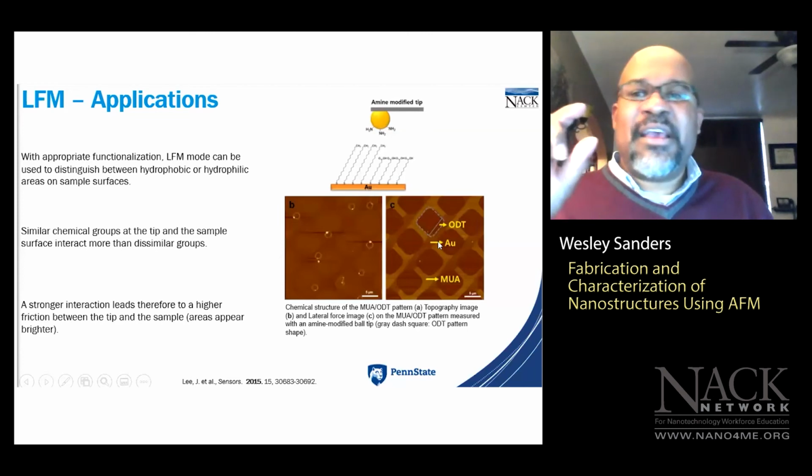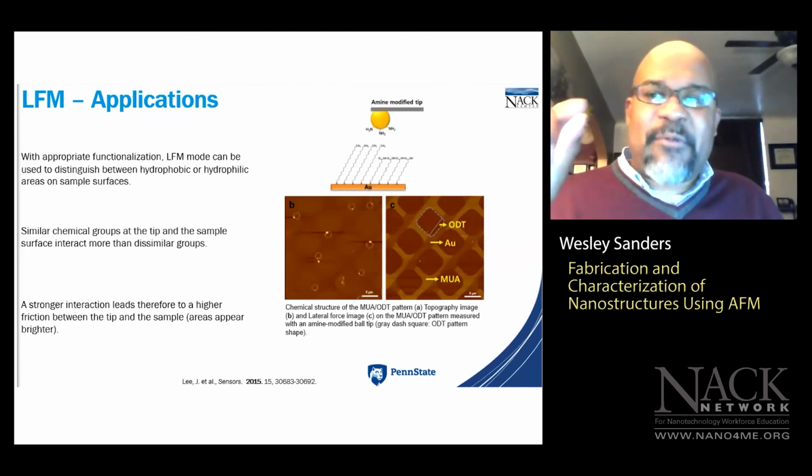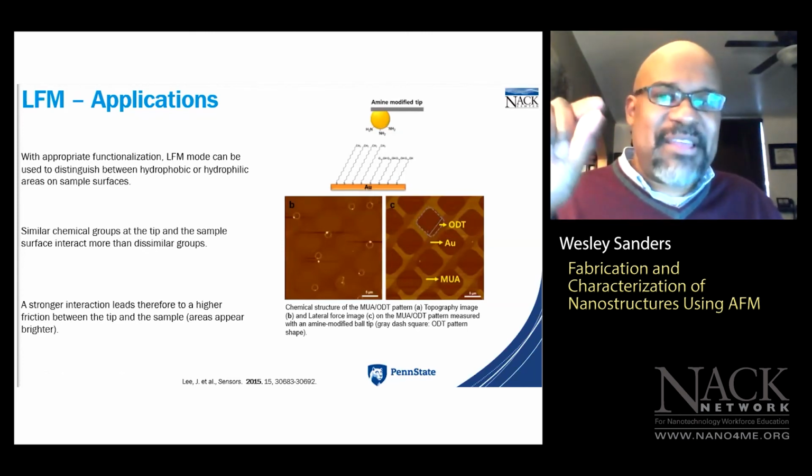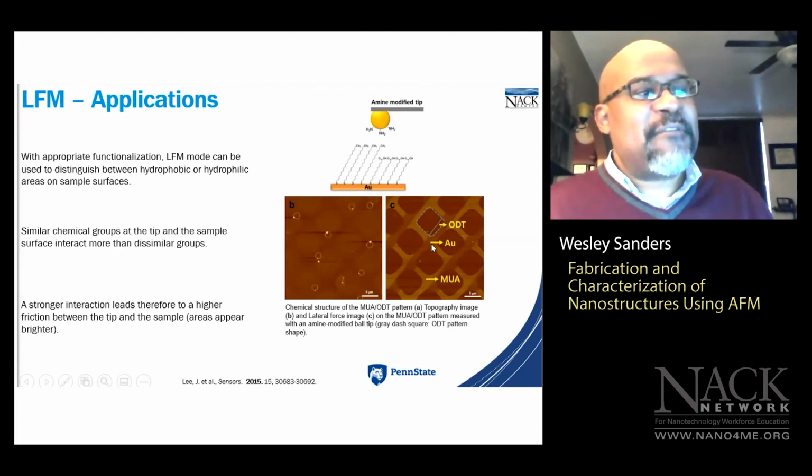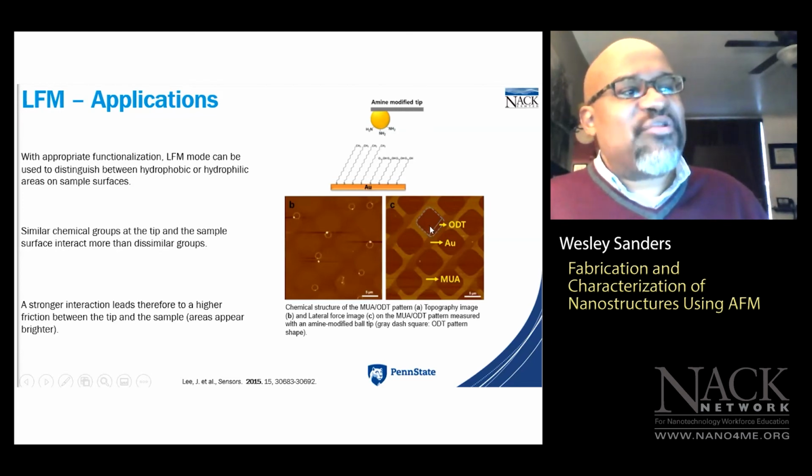Okay, so these alkane thiol thin films are ridiculously thin, extremely thin. So it would be very hard to observe the topography using standard contact mode. But with lateral force microscopy, you can clearly see the 3 different regions in the LFM image.